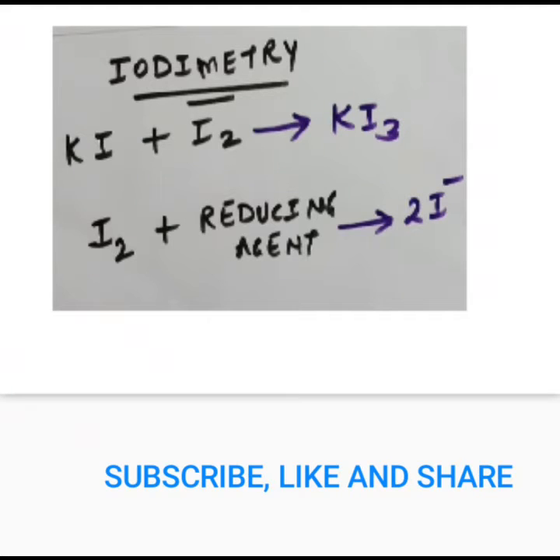Hello students, in this video I'll be discussing two aspects related to iodimetric titrations. First, the general principle of this titration, and secondly, the aqueous iodine solution, how it is made, which can be used efficiently within this analysis method.